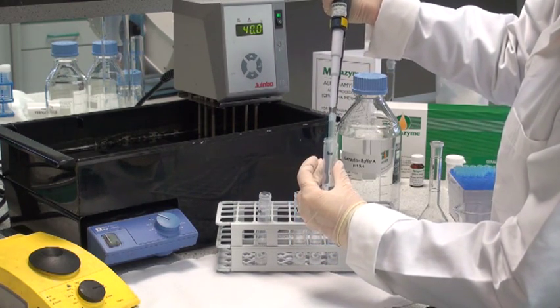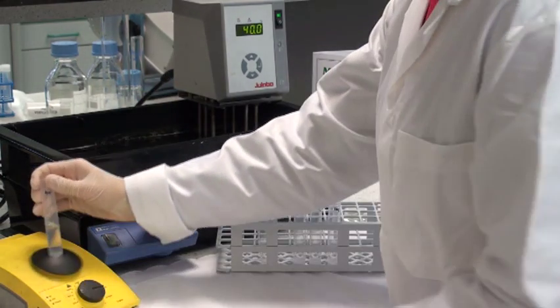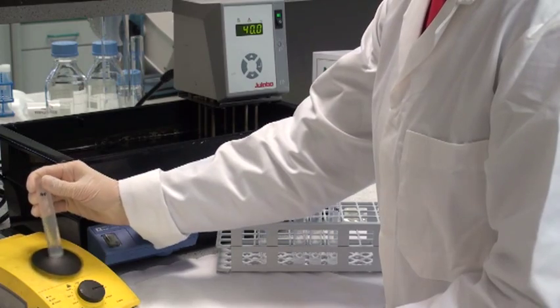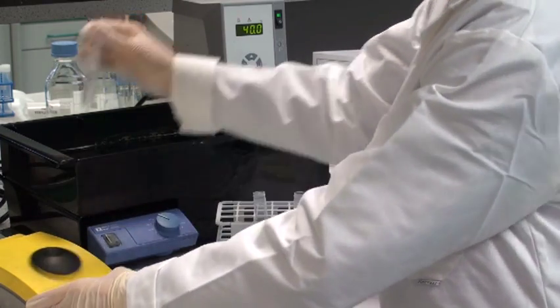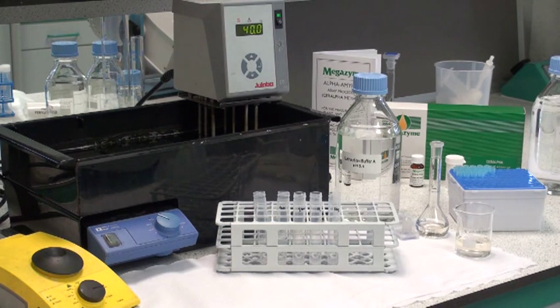The solution is mixed very thoroughly on a vortex mixer. This whole process of dilution of 0.5ml of the enzyme or diluted enzyme into buffer is repeated up to 100,000 fold to ensure that the enzyme activity is on scale.